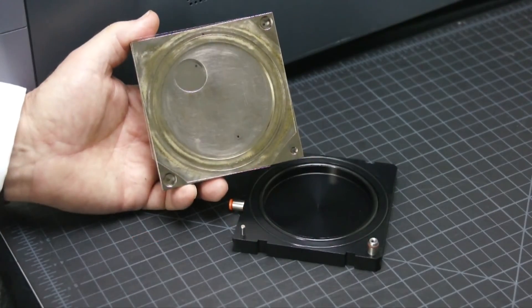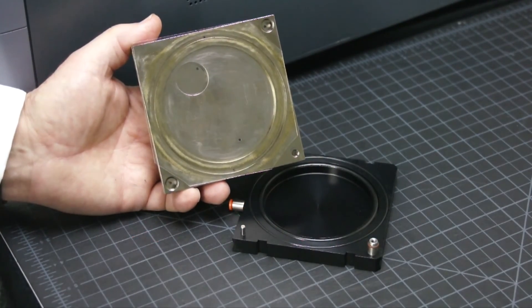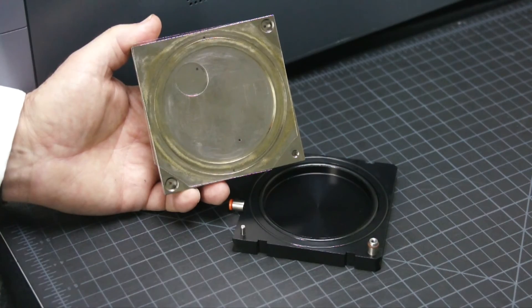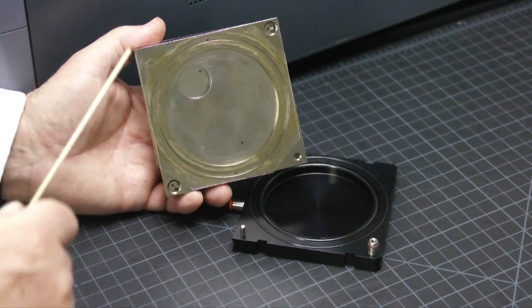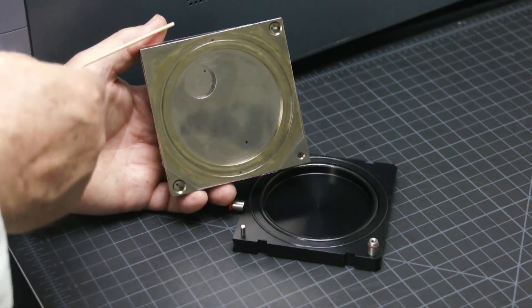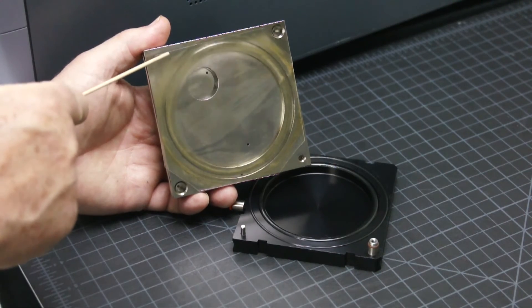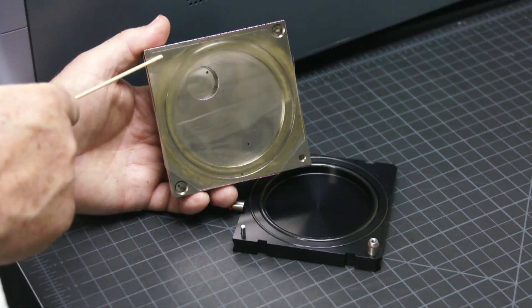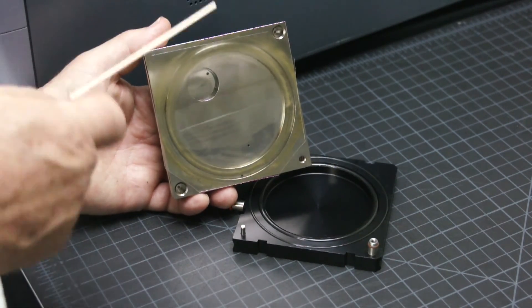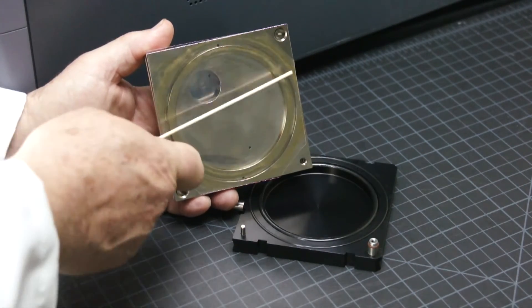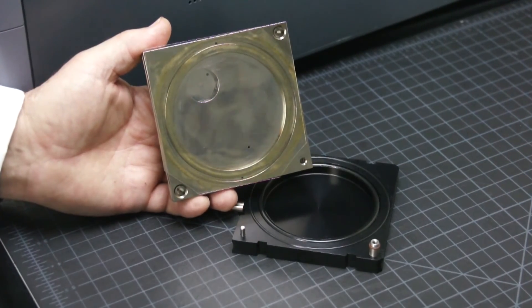Of course, we've installed MoCon's patented TrueSeal flush ring test cells. Their function is to remove any ambient air entering the cell between the film and the cell. The impact of this technology is to lower the instrument's baseline, effectively increasing repeatability 2.5 times.